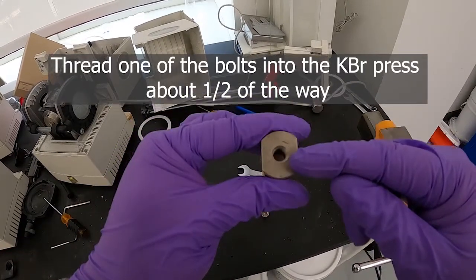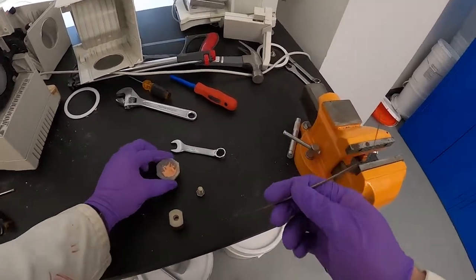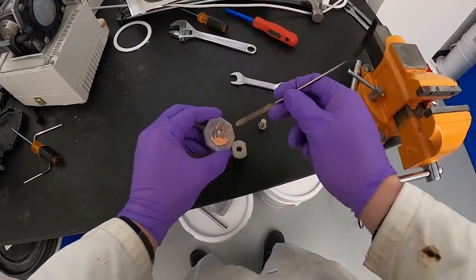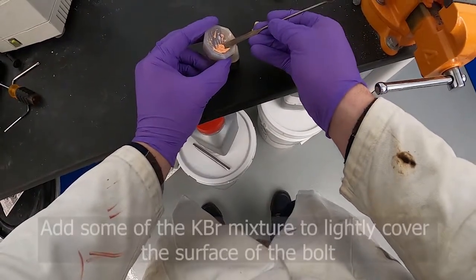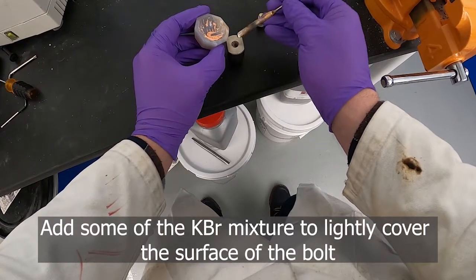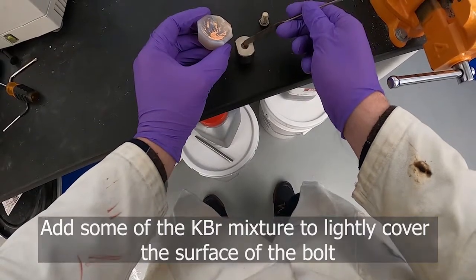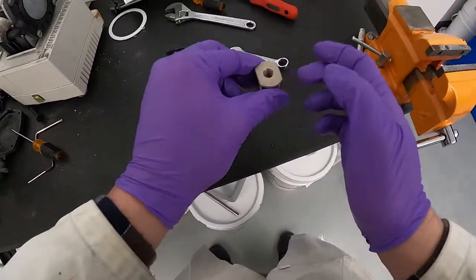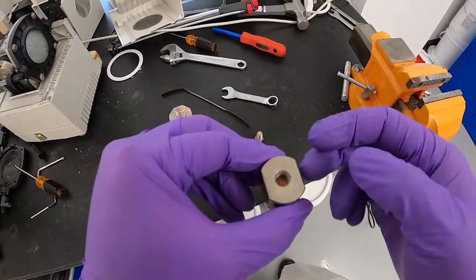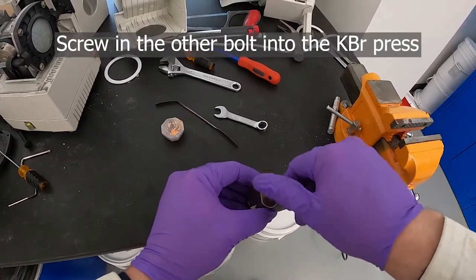You can see the end of the bolt down in there. We'll carefully take our mixture and add it to the top of the bolt — we just really need a little bit, just enough to cover the end of that bolt, maybe just a tiny bit more. You can see down there the layer of compound on top of that bolt is not very thick; we don't need a lot. Then take the other bolt and thread it in.